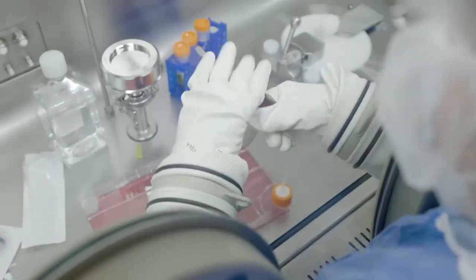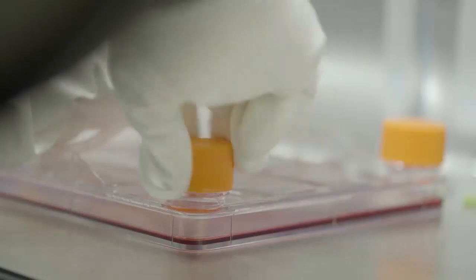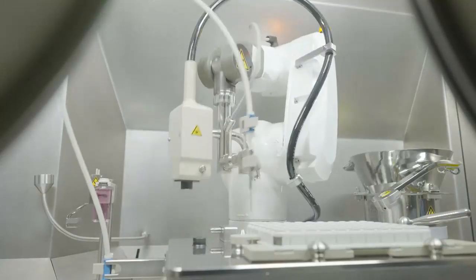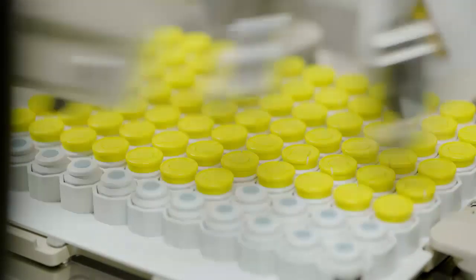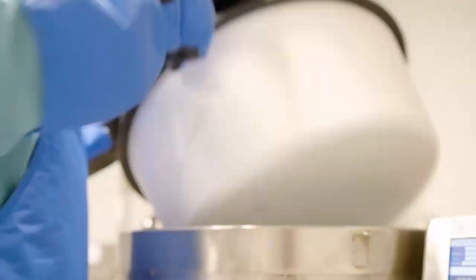From there, the rest of the process gets really simple. We expand the cells, we grow as many of those cells to make as much treatment as possible. We purify those cells to select for just the appropriately gene-modified T cells that we want to infuse into a patient. Then we move to the robot. Here we have an automated system that fills a series of vials, laser seals the filling holes, caps those vials. We inspect them, we freeze it down, and then we store it long-term until the first patient needs their treatment.